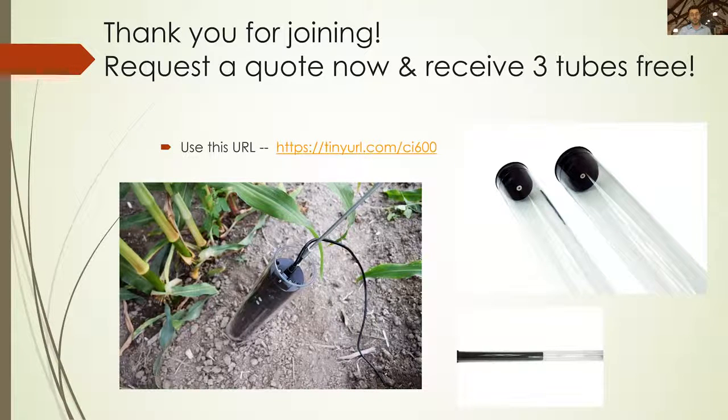So the next question we have is, with a 45 or 60 degree angle, what is the soil depth being monitored? So we do hand out 1 meter tubes. However, you can use even longer tubes than that. So you can actually do a soil depth of, I would say, 2 meters fairly comfortably, given enough sliding rods. After that, it gets kind of difficult to handle as just a person. You need more like machinery in place to do that. But you are able to do scans at each one of those depths. So that way, if you want to get a massive picture of what you're looking at, you can stitch all those scans together.